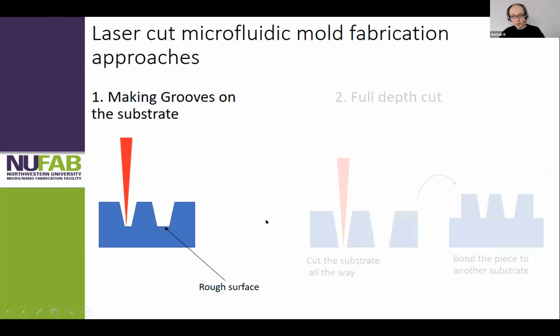All right, so how do we do this? It has this focused laser beam. It's a very high intensity laser. As soon as it strikes the surface, it creates a very hot plasma, which expands the gas around it. That expansion creates a shock wave. That shock wave breaks off material, and the material ablates off from the surface. That's how we go deeper and deeper.